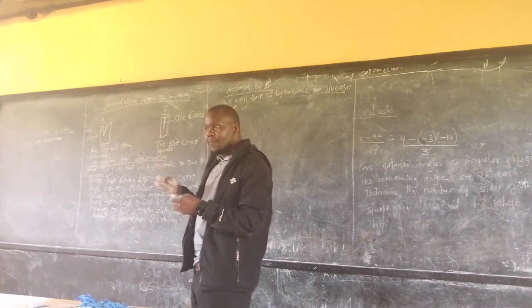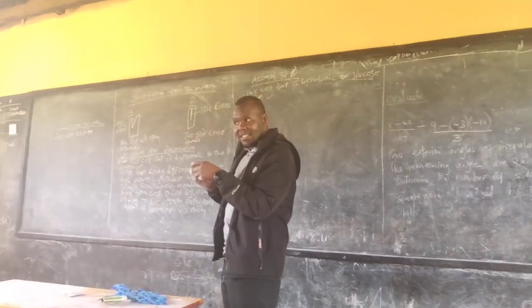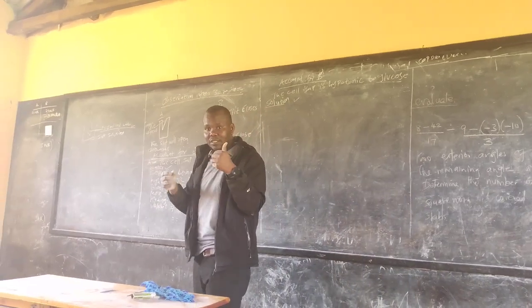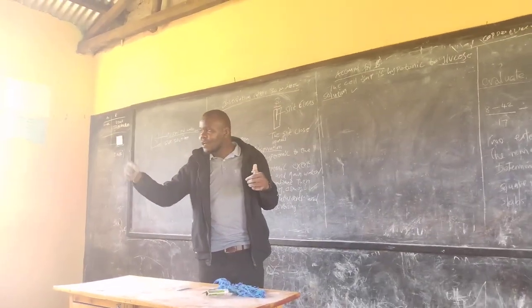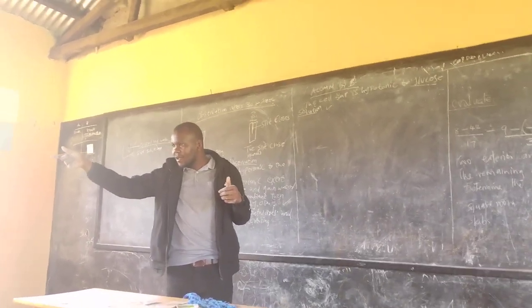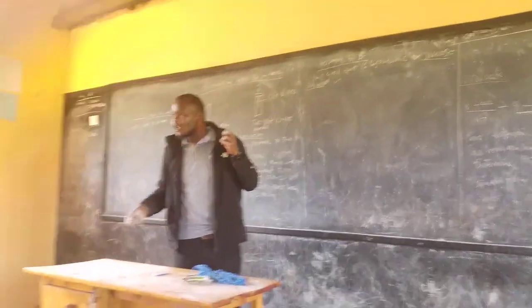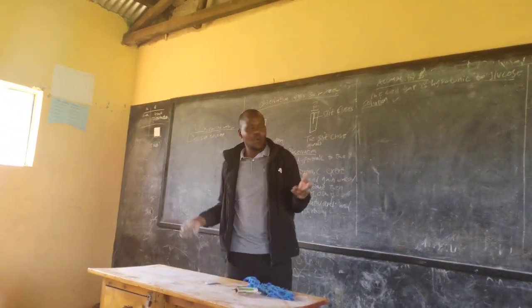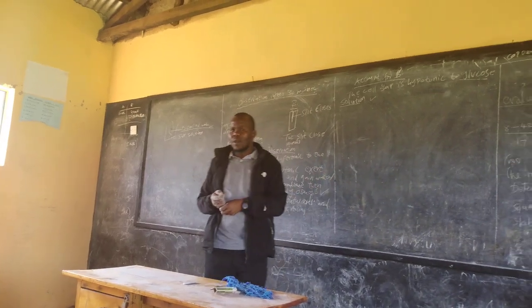It's drawing. If you speak about losing, you can say that the cells are losing water. But you can speak about this one drawing water from the cells. If it's drawing, it means the other one is losing. That is the same thing, right? When it has lost water, what will happen?